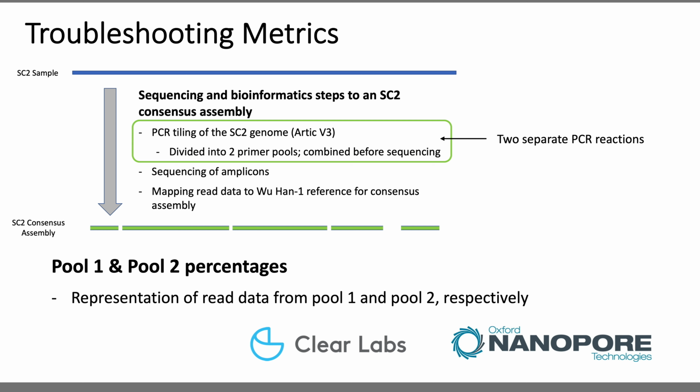It's also worth noting that this metric is only available through the Titan ClearLabs and Titan ONT workflows, since both of these pipelines utilize the Arctic Medaka protocol for assembly, which makes access to these numbers incredibly straightforward. Titan Illumina PE and Titan Illumina SE, unfortunately, perform consensus assembly through a different methodology, and calculating these values will take some level of additional development before we can grab these metrics as a default output.